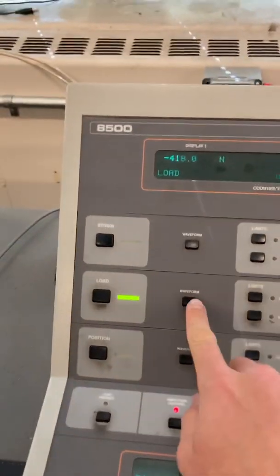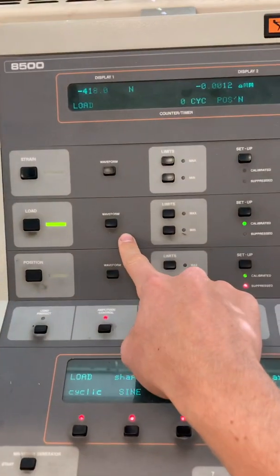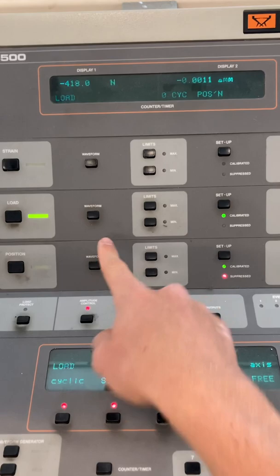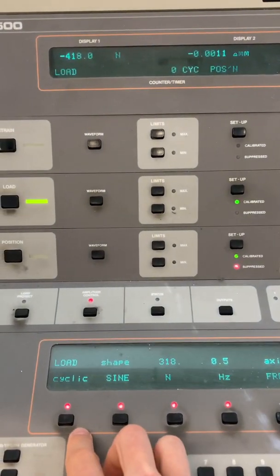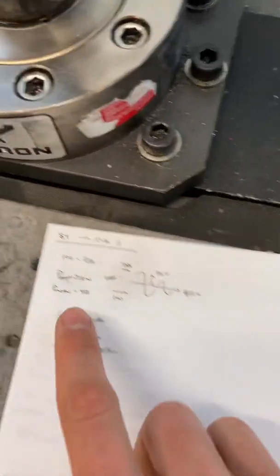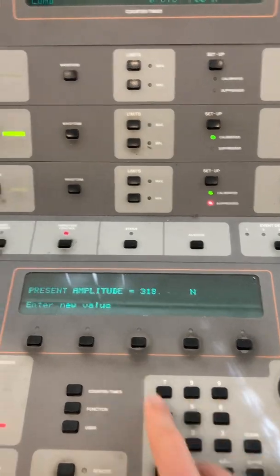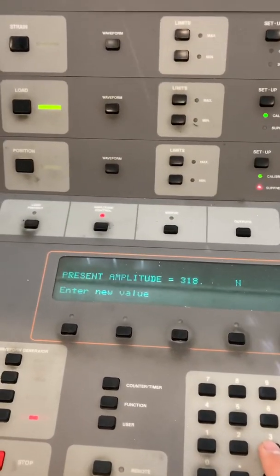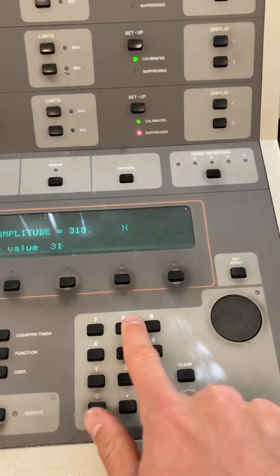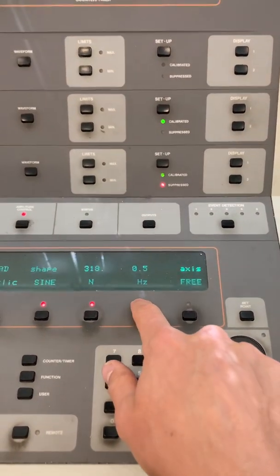Now we need to check our waveform. This is a load control test we're running — make sure it has the desirable parameters. We want cyclic sinusoidal load; the amplitude is 318. If you want to change this, click it and enter your value. We'll put in 318, enter, 0.5 Hz — looks good.